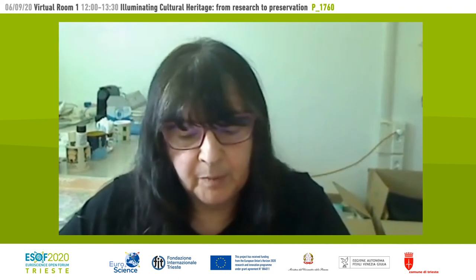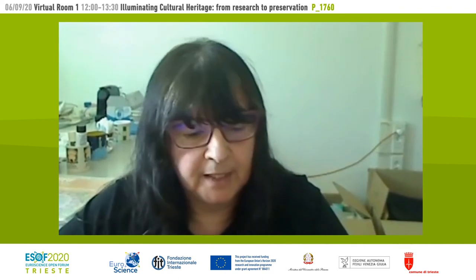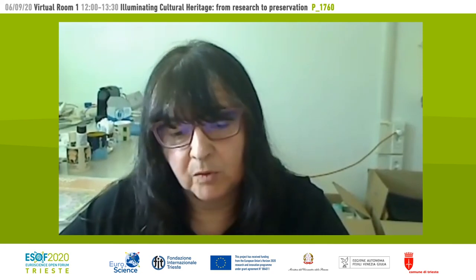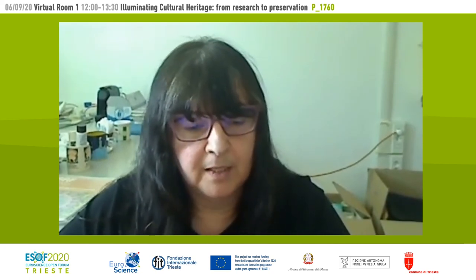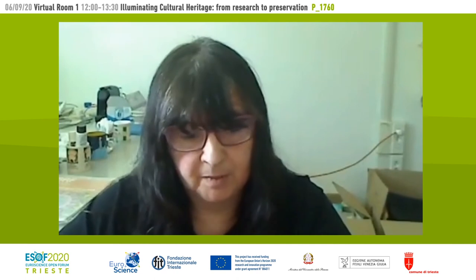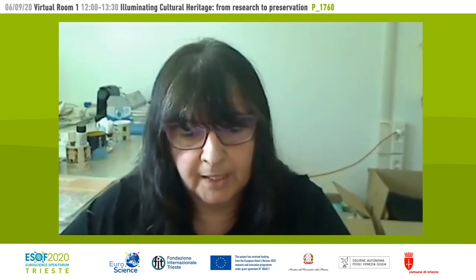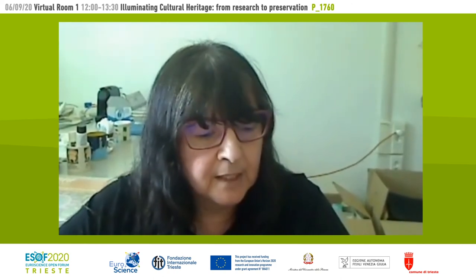And so we help them to really focus on the right technique, to contact the right people inside Elettra, or sometimes we advise them to contact other people in other laboratories connected or in collaboration with Elettra.